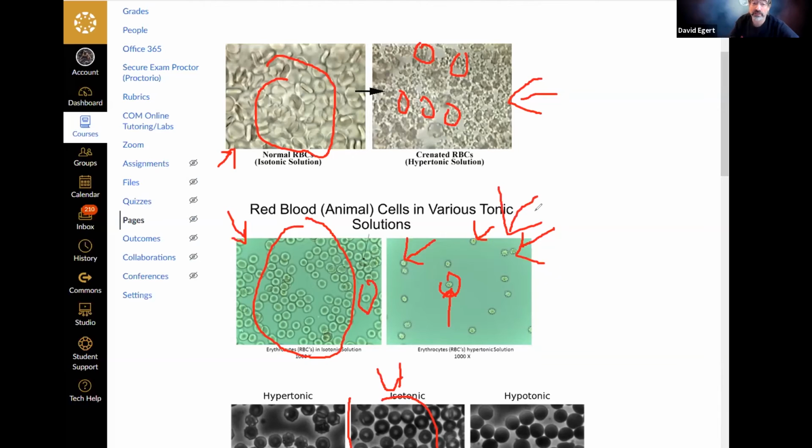The one where you had the hypertonic saline, right? So this is what happens when you have a little cell that loses its water and shrivels up. These are like the raisins I'm talking about. Right, so let me go back here.